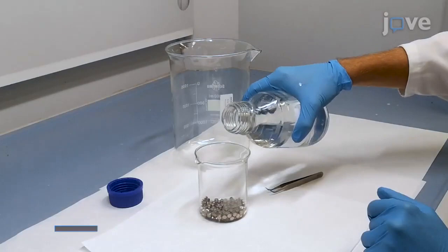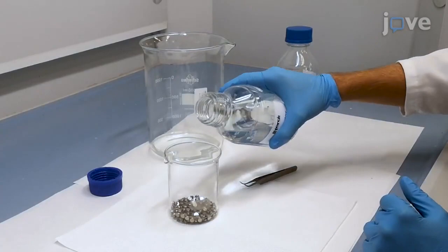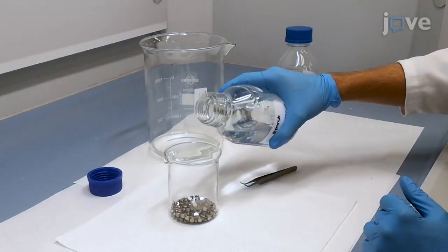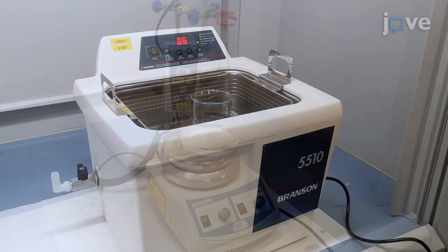Begin the titanium surface functionalization by washing the titanium discs with deionized water in a glass beaker. Then discard the water before washing the discs with 70% ethanol. Decant the solution to sonicate the washed implants at 50 degrees Celsius for 5 minutes in deionized water.